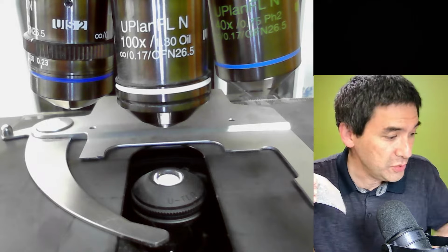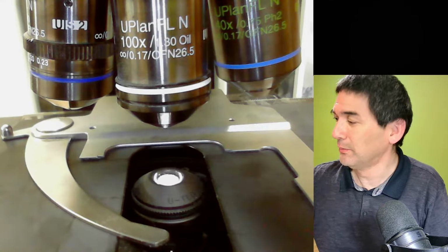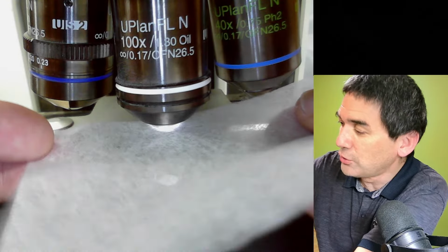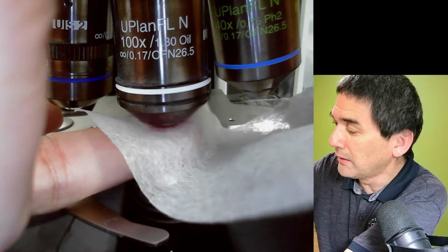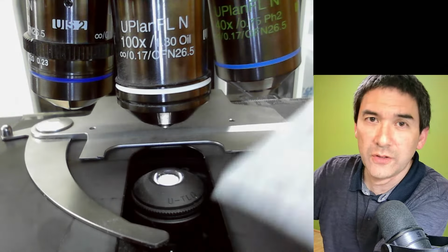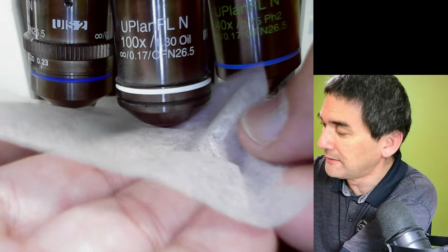What you do is you use the lens cleaning tissue paper. Here it is. It looks very, very thin. What I usually do is very slightly remove any excess oil, because the oil will collect dust. And if there are any dust grains in there and you clean it, it might scratch the lens a little bit. So, essentially, very lightly.